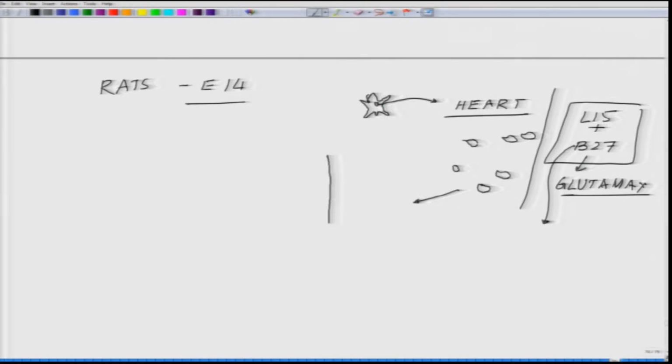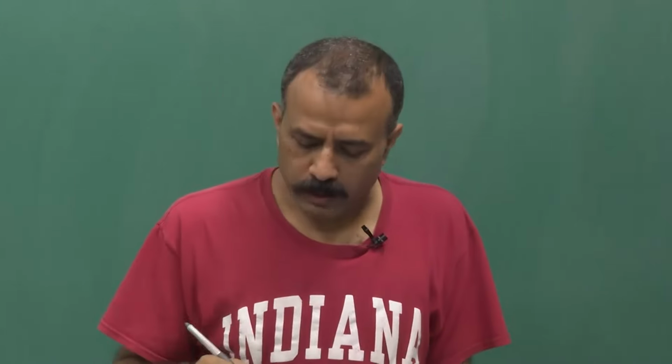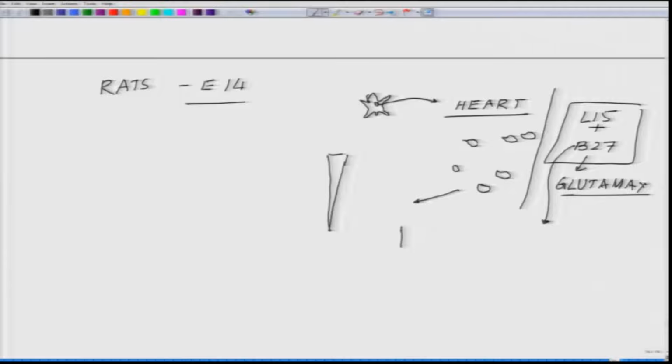The easiest way to dissociate will be mechanically. I believe this is the easiest way, because these hearts are very fragile, very easy to work with. In a vial, you collect the hearts like this. Say, for example, if you could manage to pull 10 hearts from 10 embryos, here is your medium.